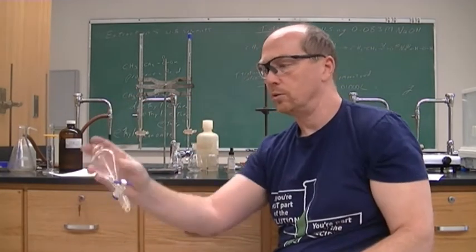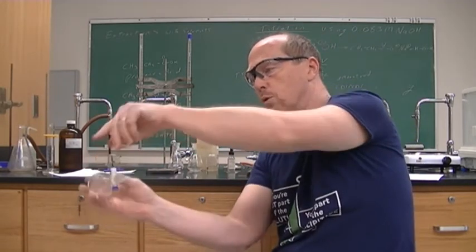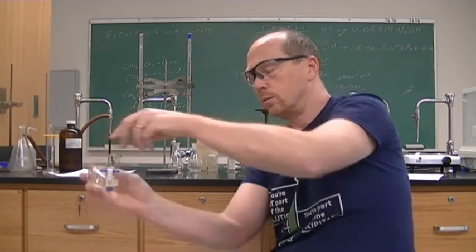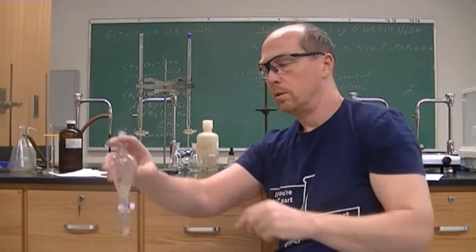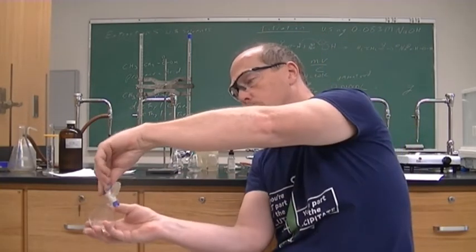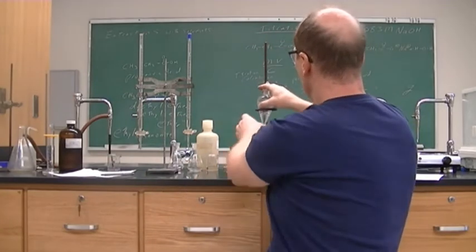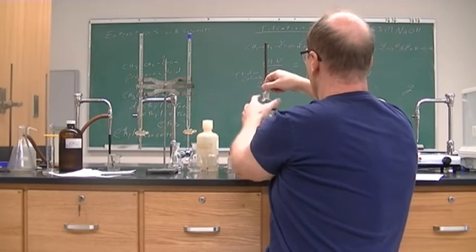So now it's not making any more sounds, so you can get a little more violent with the mixing. Still a little bit. All right, so now I didn't hear anything that time. So we have thoroughly mixed this. So we put it back up here. Again, remove the top or the water layer will not come out.